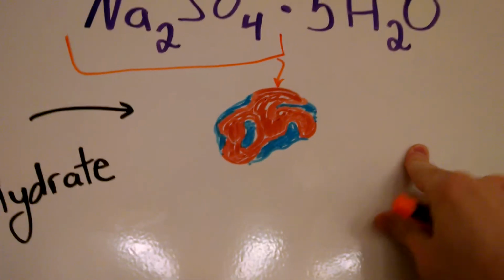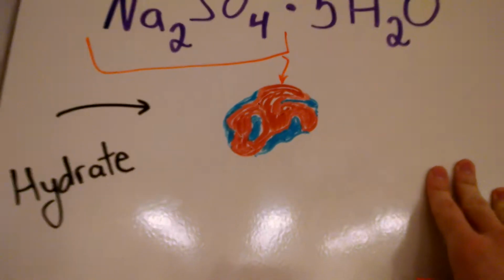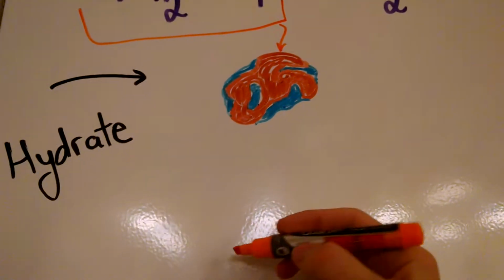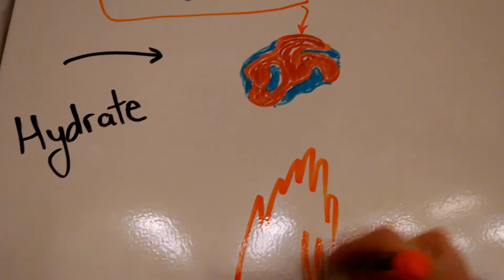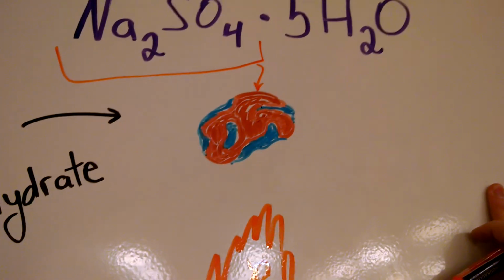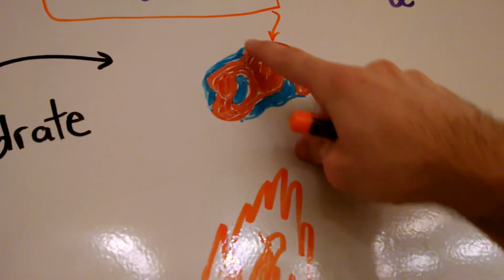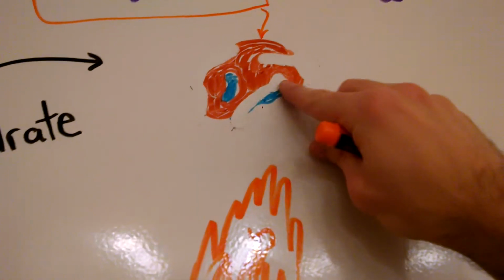So just looking at this hydrate, I feel this is a good representation of it, but you personally can't take out the waters just with your fingers or your hands. You have to actually heat up the hydrate. So basically heat it up over a burner, get the fire going, and eventually what should happen is that the water molecules should slowly vaporize.